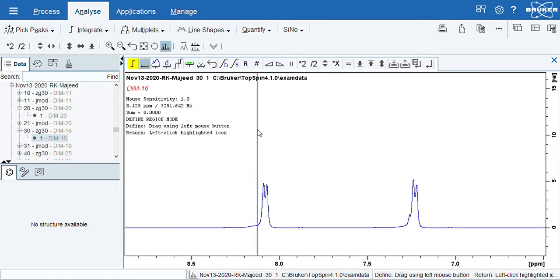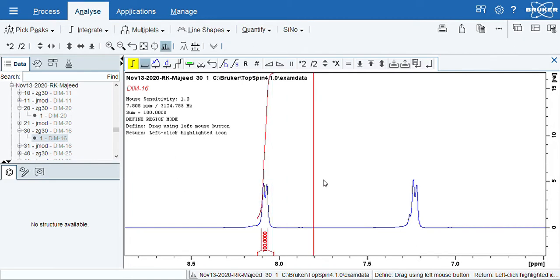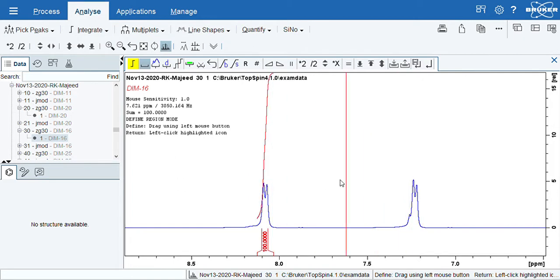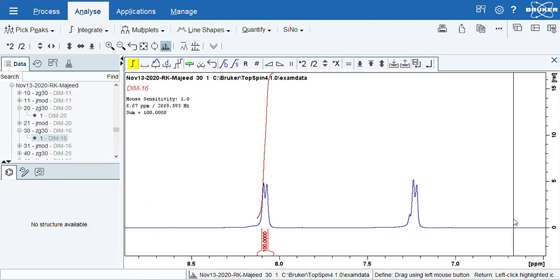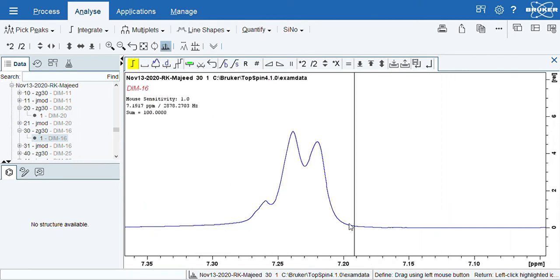Now you can do the integration. So integration is nothing but you need to drag your cursor for the peak. Basically it will take your area. So in this peak I have solvent peak also, so I am just zooming. Then I will select it and basically do the integration of this.